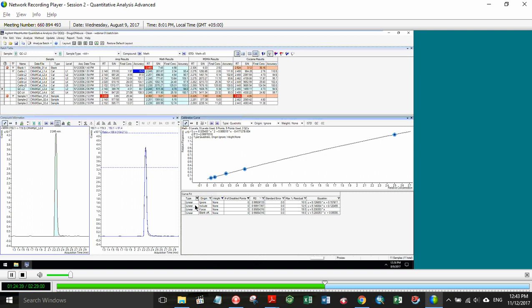So now I can see my options with only the filtered linear, and these are the different ways that it would affect it depending on what I do with the origin. Again, unfortunately, there's no way to default filter, but the filtering tool is there, and you can use that once you get into it to at least limit what's presented to you.